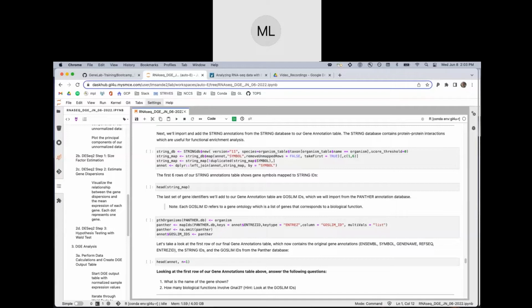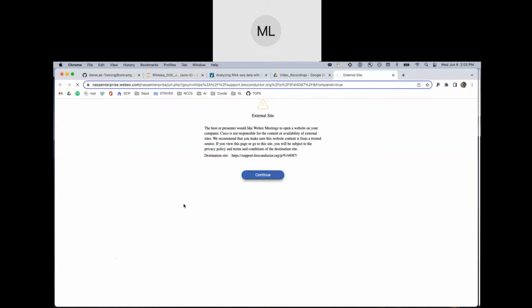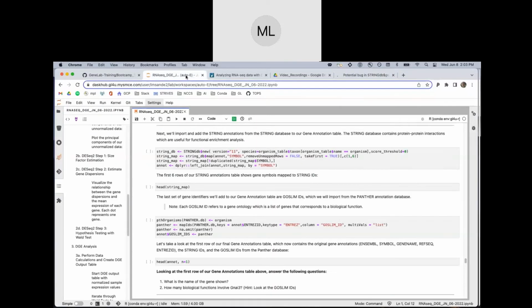And I'm going to put the link to the forum where I submitted the problem to them. It's pretty dense. You don't have to look at it at all if you're not interested, and I don't think you should read through it now because it'll be distracting. But it just gives you an idea of how a regular user in the community thinks they saw a problem, and I shared it with them and said, here's what I saw, here's how I think we can fix it. And then they implemented the fix, and it's great.